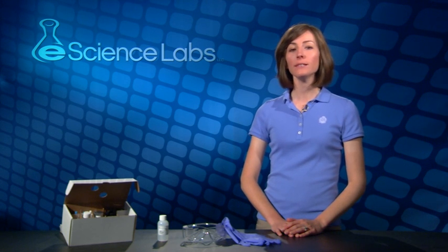Welcome to eScience Labs. We're glad to have you. Before we can go any further, we need to take a few moments to discuss lab safety.